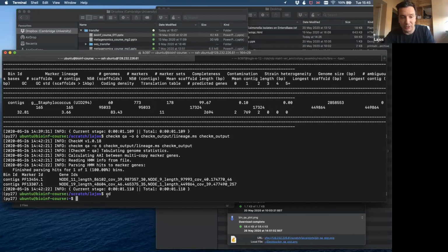Before we do the installation, let's get out of the CheckM environment, because we don't really want to put anything else in. If I start the conda installation now, I think we are putting all the new files into the CheckM environment, and we don't want to cause any collision or problems between our newly installed program and the one which has its own environment. So what we have to do first is say conda deactivate.